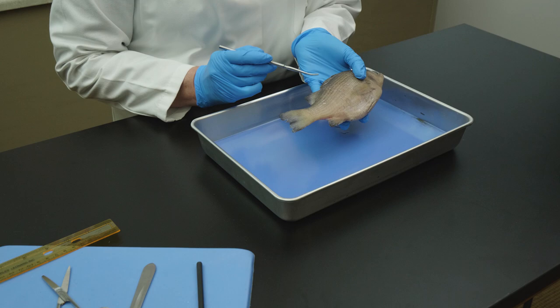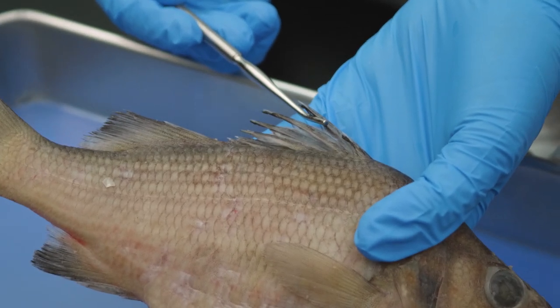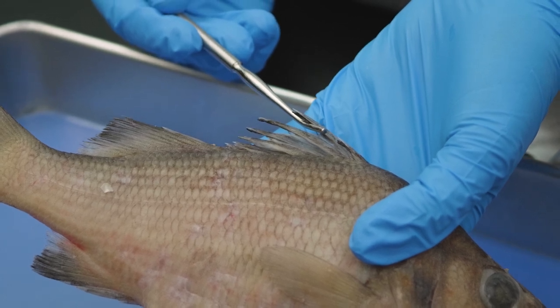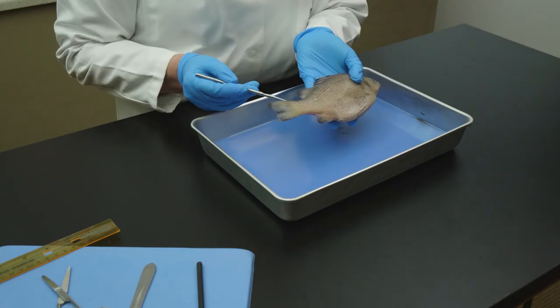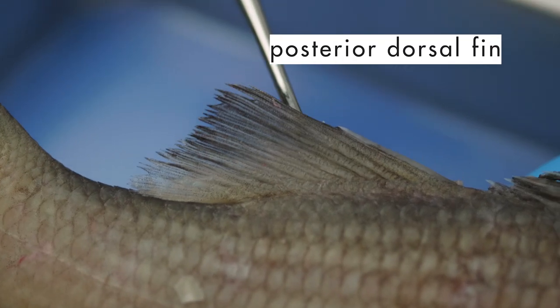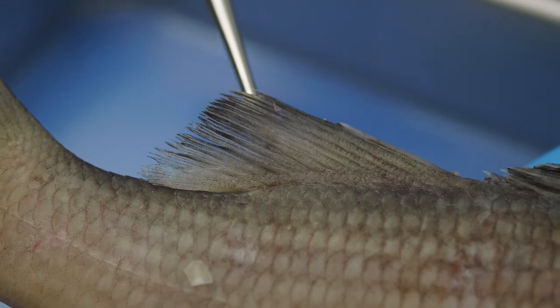On the dorsal side of the perch are 2 fixed fins called dorsal fins. When the fish is swimming, the dorsal fins help keep the fish upright in the water. The anterior dorsal fin has sharp, stiff spines, so it is also called the spiny dorsal fin. The spines are used for defense. The posterior dorsal fin does not have spines. Since it is softer than the spiny dorsal fin, it is called the soft dorsal fin.